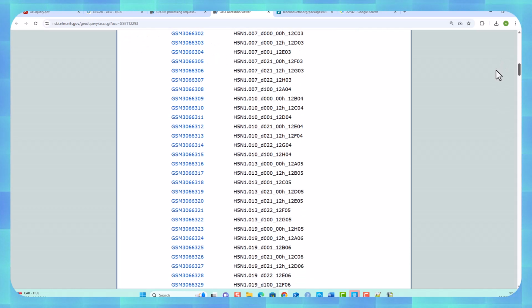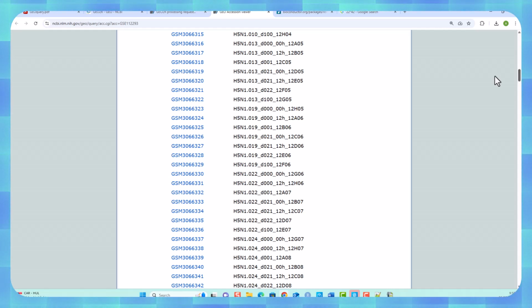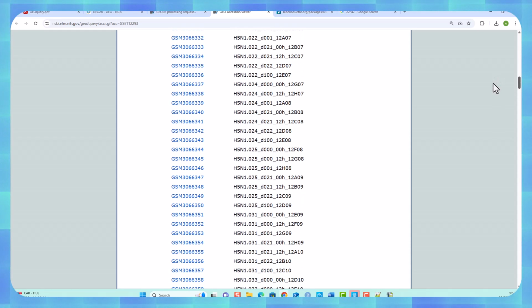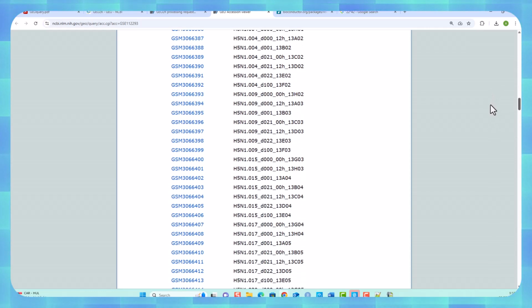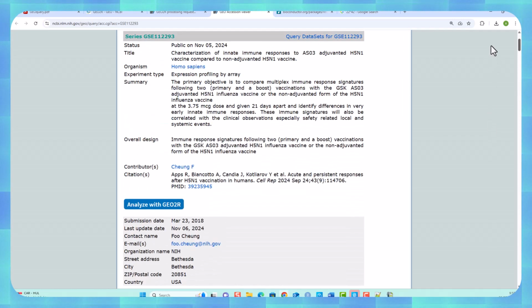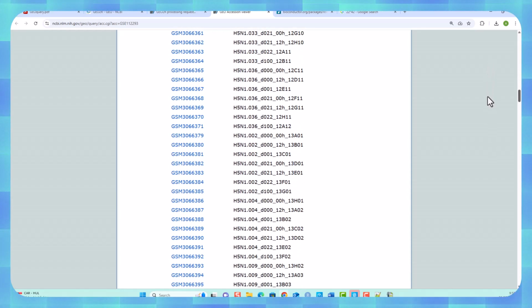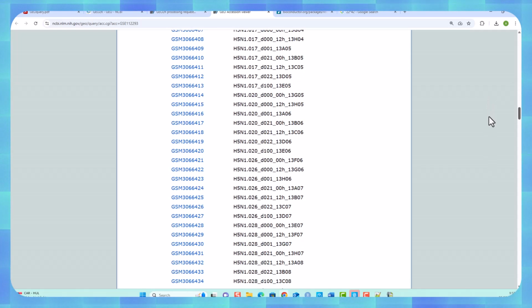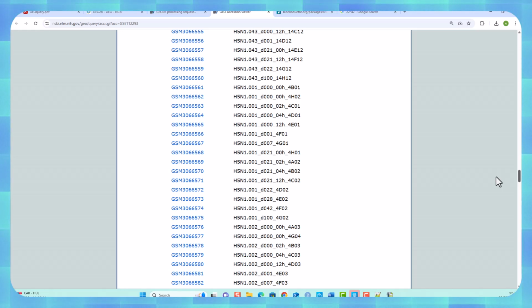What I was thinking about was going to process the raw data and do the analysis again from the start, so not use their processed numbers. It would be an absolute nightmare to do, because they're not even stored in the correct order.